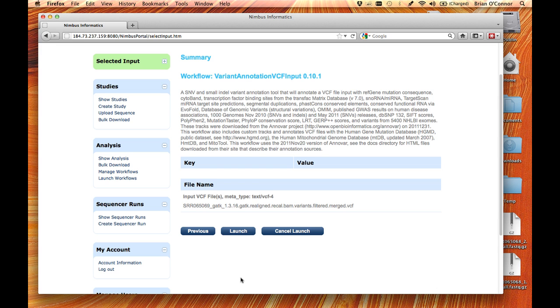What's cool about this is you can take this, database that VCF file, do queries on it. You can use that in your own scripts to have everything be VCF file format and have these extra annotations added as simple key value pairs, which is actually very, very flexible and very easy to use. This particular workflow is based on ANNOVAR, and you can see it's actually quite complete in terms of the amount of annotation that it provides.